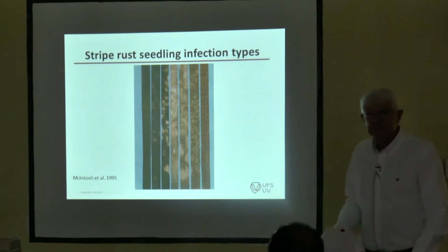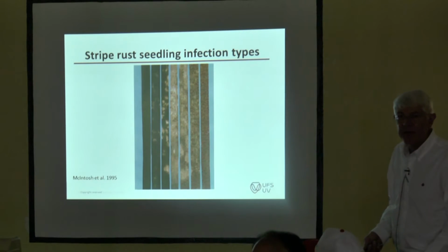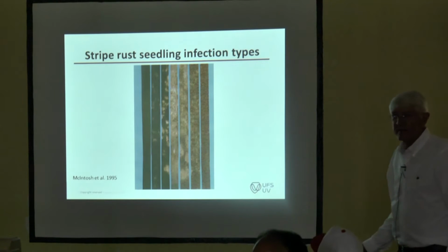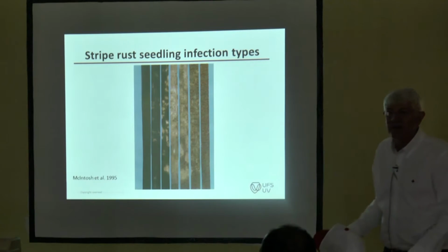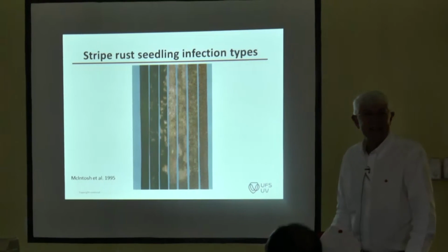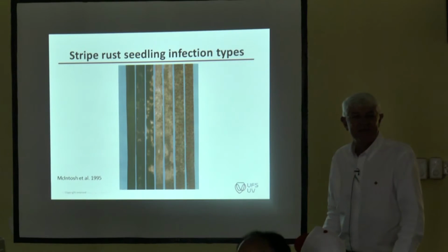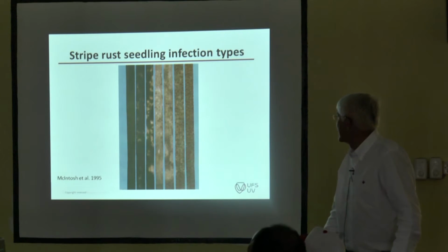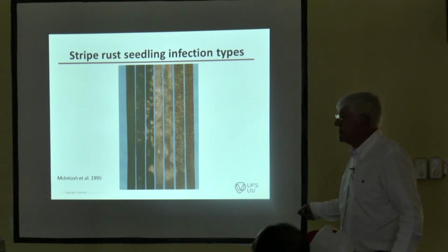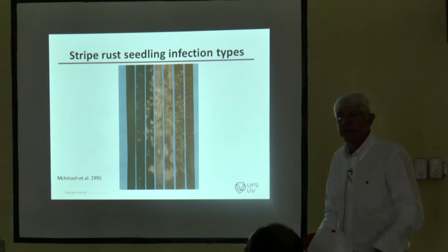So the second leaf from the right, you're calling it low. I'm asking the group. It's actually compatibility. It's indicating compatibility. There is some resistance gene which is compatible with this. Okay, I would probably call it a 3 double plus or something, or maybe even add a C if there's a lot of very clear chlorotic tissue. Robert, how would you score that one?